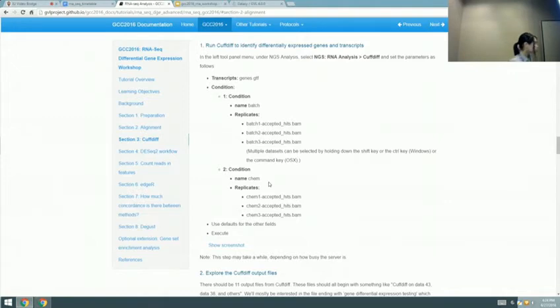So that's why we use that. There are other splice aware aligners like this, but if you're going to do RNA-seq, you really need to use it. It should be used that way. Okay, does that make sense? Good.